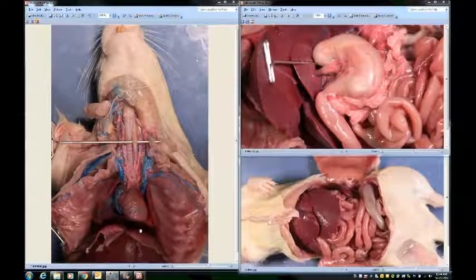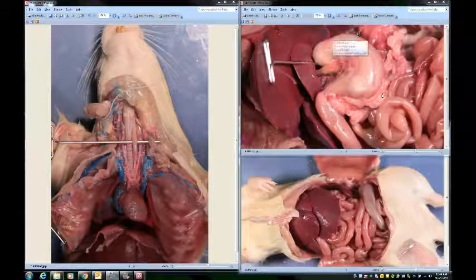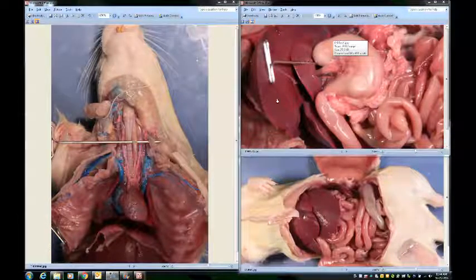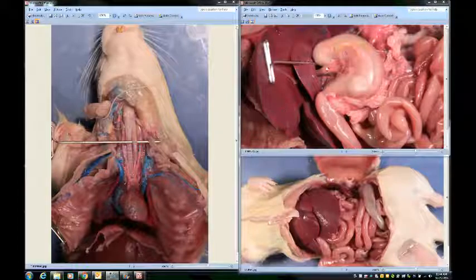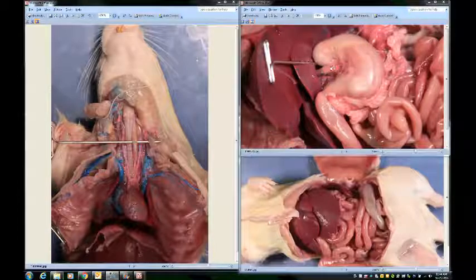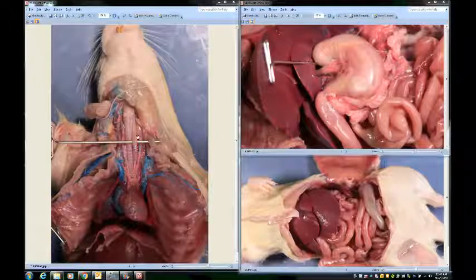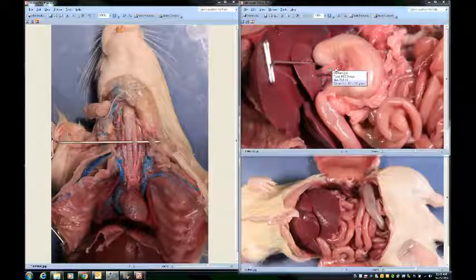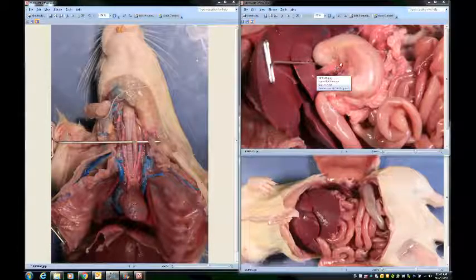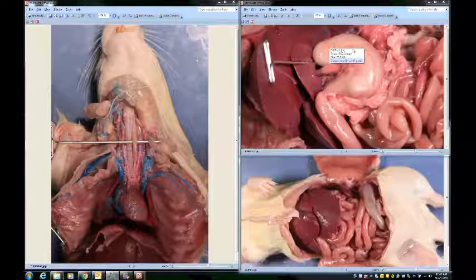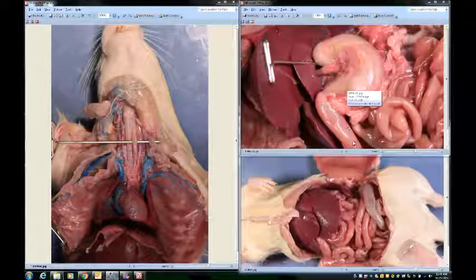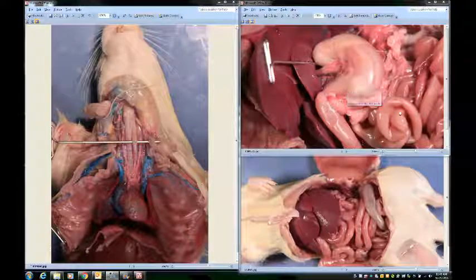The esophagus disappears again behind the heart and lungs, so it'll be hard to see that portion. But in the picture on the top right, if you move the lobes of the liver up, you can actually see where the esophagus is going into the stomach, which is this big organ right here. So if you can't find the esophagus beneath the trachea, look for your stomach — you'll see the esophagus going into the top part of it. Where it connects, that's your sphincter.